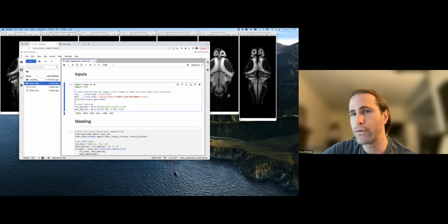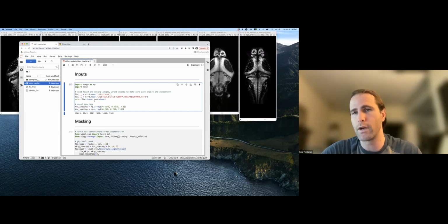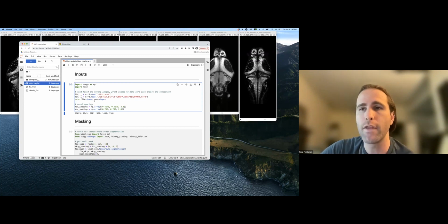But there are other tools that you can use to do image registration like ANTs, Greedy, John Bogovic's great BigWarp package, lots of things. And you can also combine a lot of these tools together, since a lot of the time, some of them will have a feature that's really important to you. And you might need two registration tools in combination to really complete your job. And all of them are compatible with a little bit of knowledge about how they can work together.